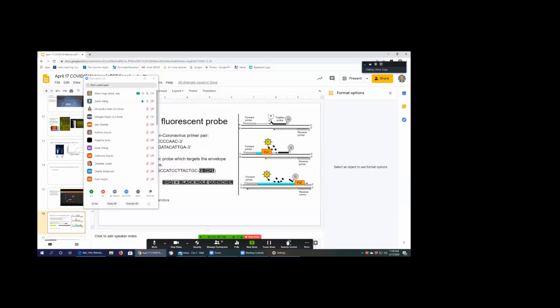So they're just floating in the reaction mixture, and they're dark because they've got the quencher attached. They're not fluorescing. And then as you cool it to 55, they bind, and they happen to bind in the path of the polymerase. So as the polymerase goes through in those 5 seconds at 72 degrees, the polymerase chugs through and splits that one. And you have lots of these in reserve. So on the next cycle, you can do it again: 55 degrees, stick, chug, fluorescence appears.